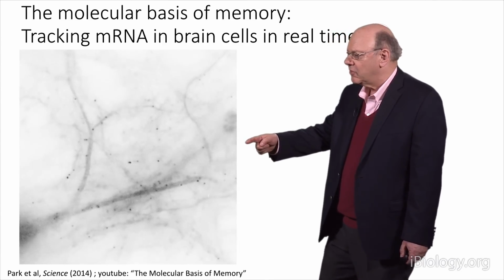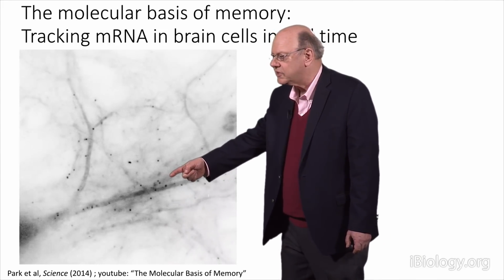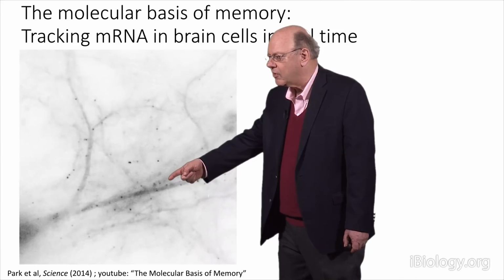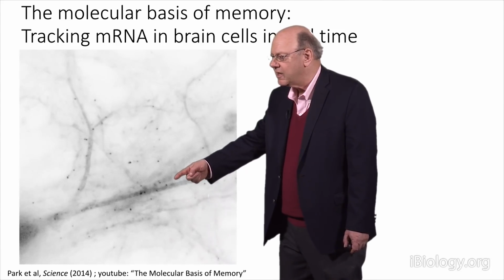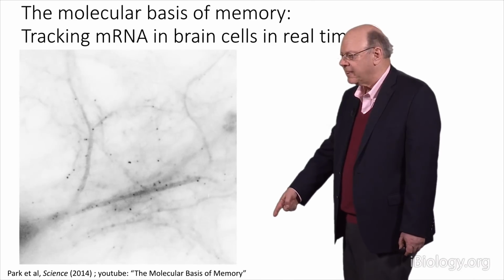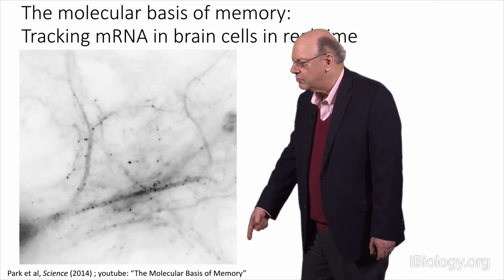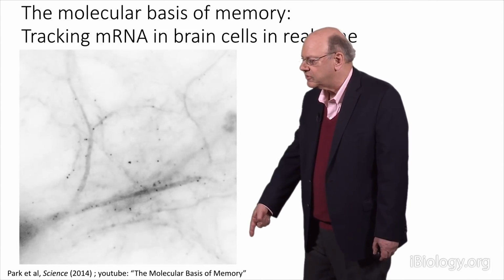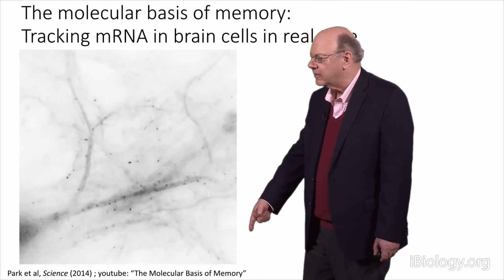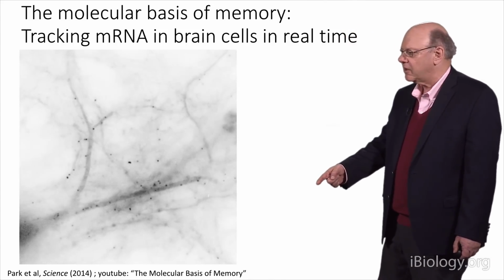And even the ones that are stationary eventually move. So if you watch this neuron for 2 hours, every RNA in this neuron picks up and moves around looking for a better place. And when this was published, this was actually put on YouTube under the heading Molecular Basis of Memory. You can look at it. It got 400,000 views just by that sort of tantalizing title.